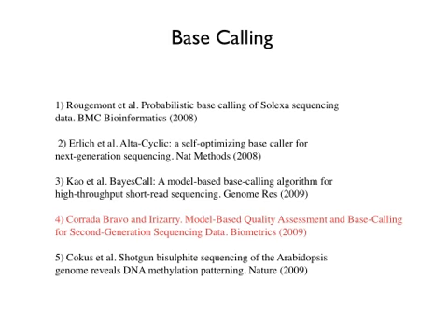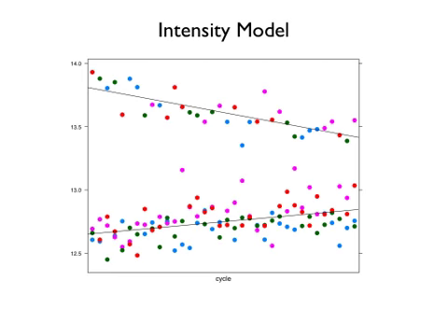So that's what the base calling problem is: turning these things into data, into reads data. And a few papers have been written about that. They're not as common anymore because it's getting harder and harder to do it because the files are so big. We have a paper on it. That's the one I'm going to talk about, but there are other really good ones out there. Bustard is a good one. We're using their ideas a lot these days. So I'll tell you a little bit about that so you can see how you can use statistical ideas to improve base calling.